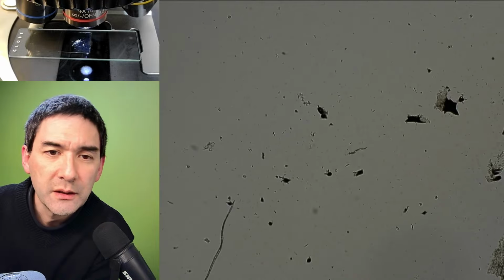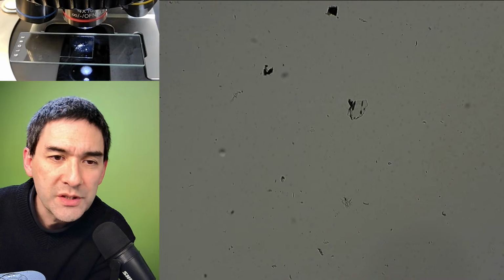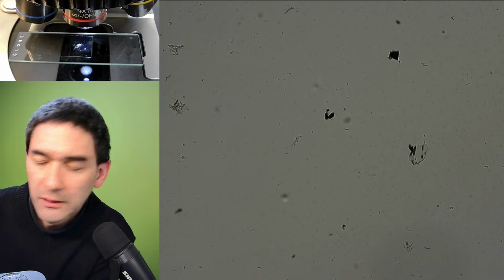You might already see a little bit of some stuff moving around, some tiny things. I'm now using the lowest magnification, of course. Yeah, there's some movement going on. It's pretty active actually, but I need to go up with the magnification here.